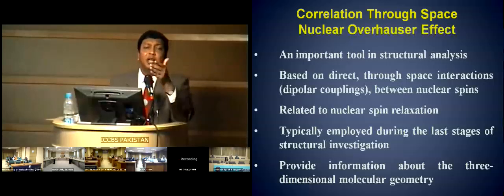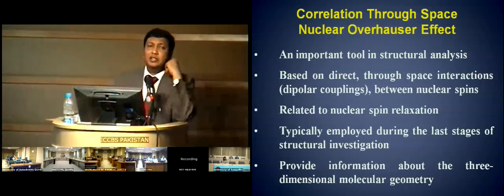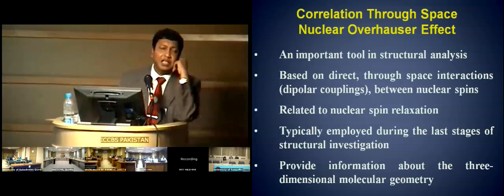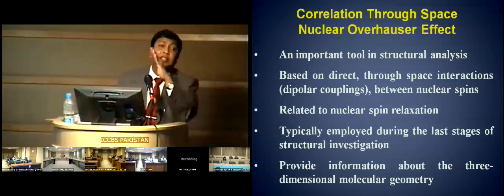If you do an X-ray, you get a gross structure with connectivity information as well as the geometry. If you do NMR spectroscopy, you first get the connectivity information and then you add the dimensionality into the structure also. This is only the second challenge.